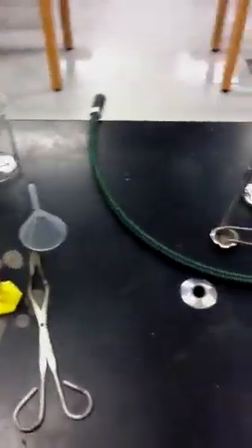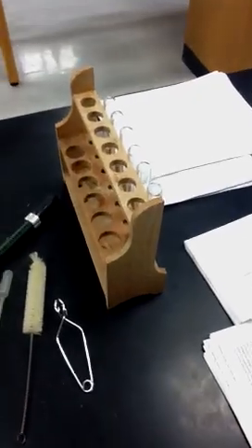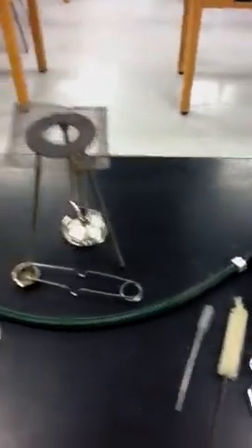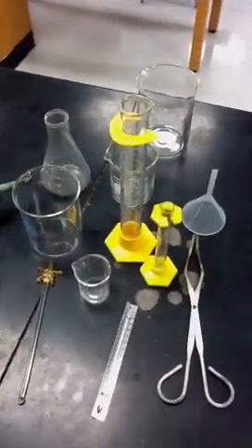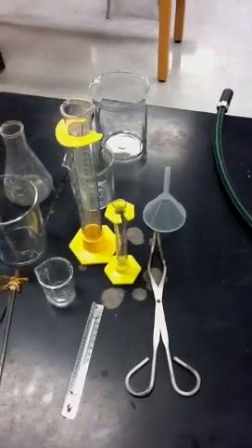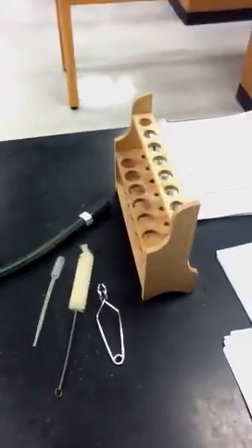Hello 7th graders, Mr. Evans here. I've got some lab equipment in front of me and you're going to be learning about what these things are, what they do, and how they can be used. This will be very beneficial to you for upcoming labs.